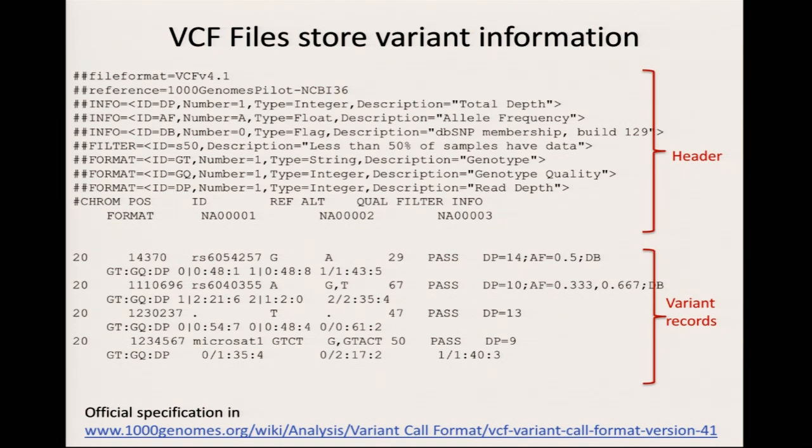After that, you have these three samples, NA1, 2, and 3. These are three samples that you processed, and you can ask what the genotypes for this variant are for those samples, right? So for this G to A variant, the first sample was 0, 0, so that means it was reference. This is the 0 allele, and this is the 1 allele, so it's 0-based indexing.